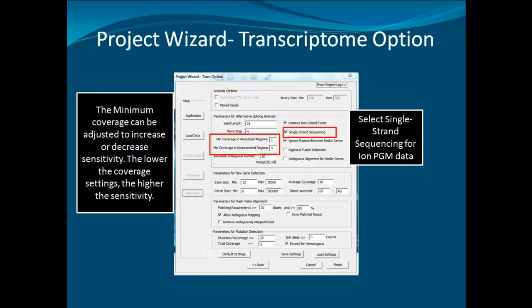In the Transcriptome Alignment Settings dialog box, there are a few important options to note. The first is the single-strand sequencing option, which must be selected when using single-strand sequences. The other settings are the minimum coverage for annotated and unannotated regions, which determine the minimum coverage needed to identify transcripts. The lower the settings, the more sensitive the analysis will be.